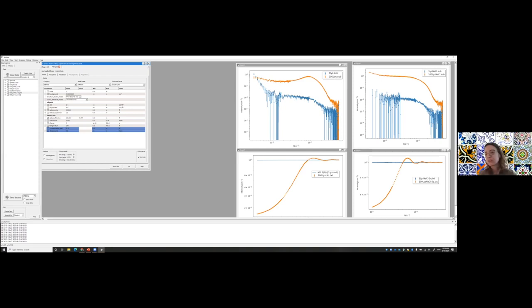Then if you have other questions. I have a question. Yeah, go ahead. So in the tutorial, it says to save a couple of times. Do you want us to send you these files, or is it for our own sake? That's more for your own, so that if you close the program by accident, or if you have a bug and you need to close it and restart, you don't lose the fits that you already have.